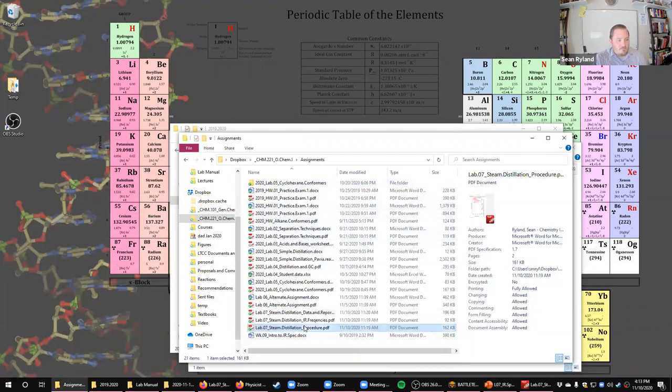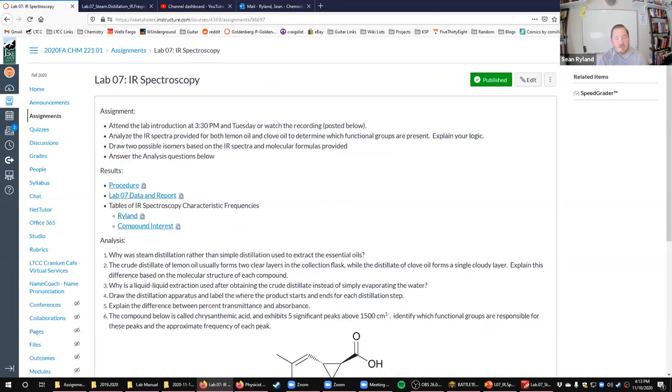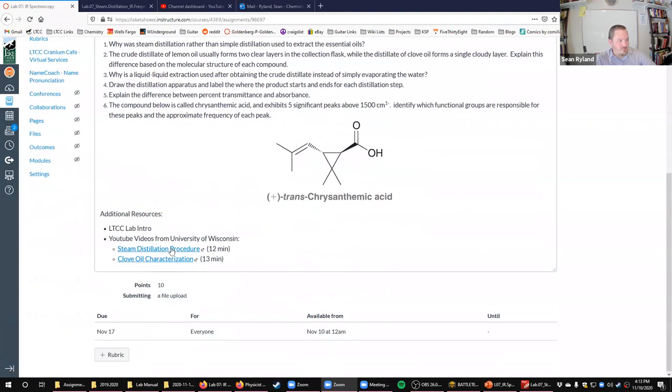Let me look at the assignment itself. It gives you a procedure for a process called steam distillation. There's a couple of good videos down here that I didn't try to make my own video for because this guy did a really good job of making these videos about steam distillation. And this is the exact same lab. This is a very standard lab. This is isolating clove oil from raw cloves.